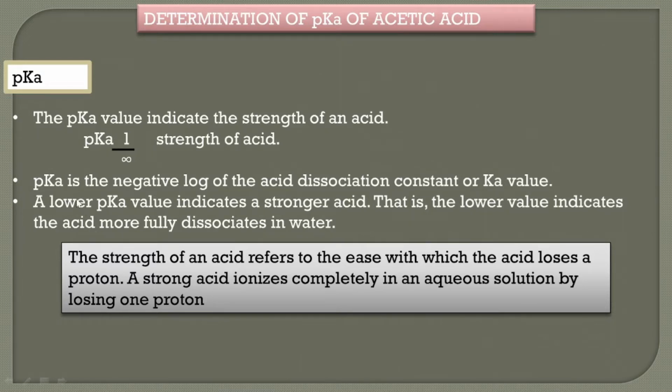Coming to here, I will write here: pKa is high, that indicates that the dissociation ability or dissociation rate of the acid is low.